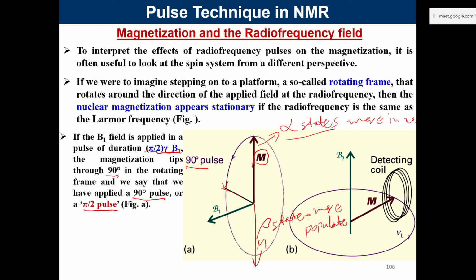Or you can say that if you have 100 nuclei, if 95 were pointing up in the previous case, that was this vector, and now if the vector is completely M, if it moves like this, then most of them, 95%, are almost in the beta state, pointing downwards.